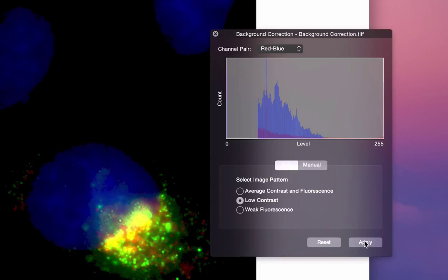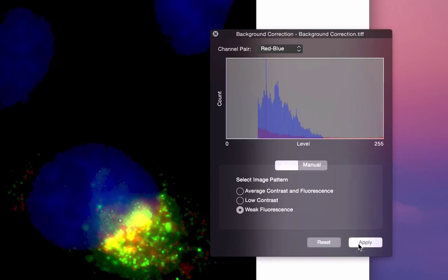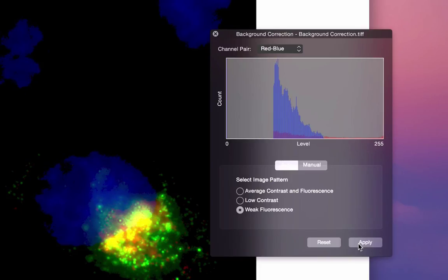To try another preset, simply select another image pattern, let's say Weak Fluorescence, and click Apply. Follow how the image histogram has changed again.